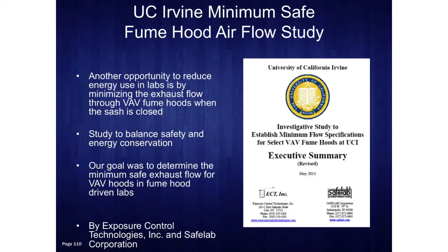Another part of ANSI Z9.5 that we're in the process of implementing is reducing the minimum exhaust airflow through our fume hoods when the sash is closed. As part of this effort, we performed a study to determine how much we can safely reduce the flow of fume hoods in our labs.